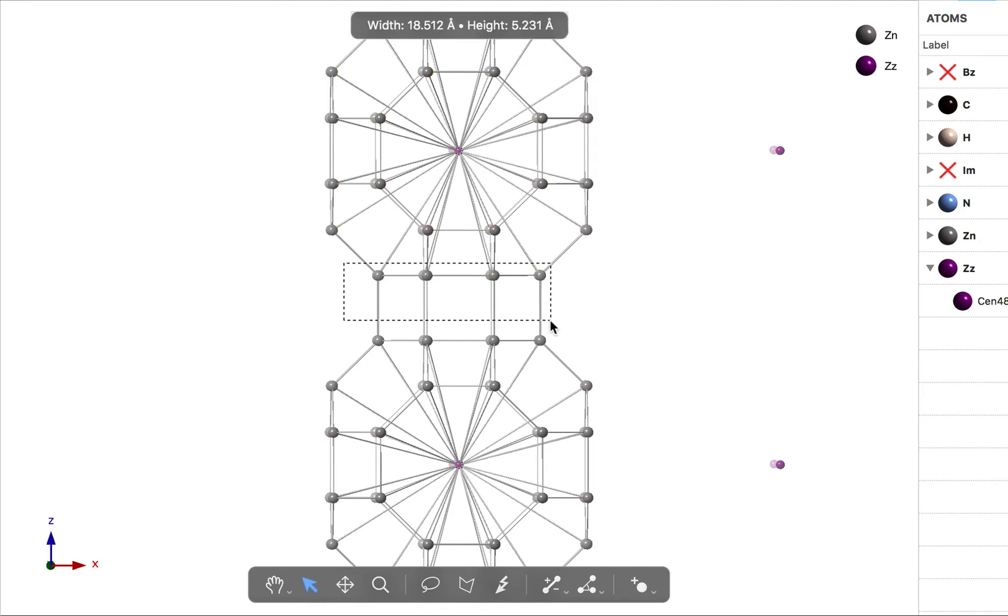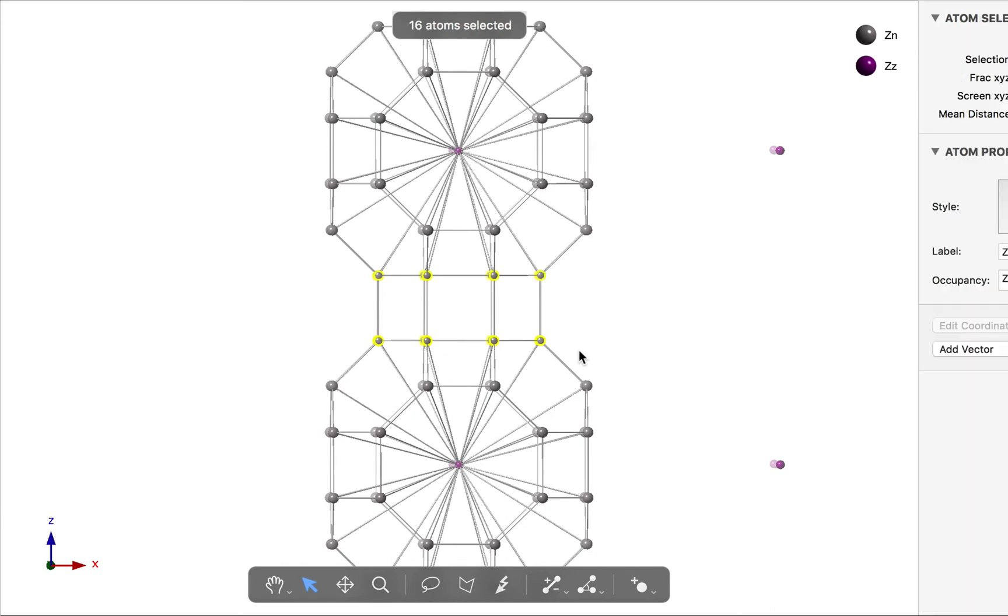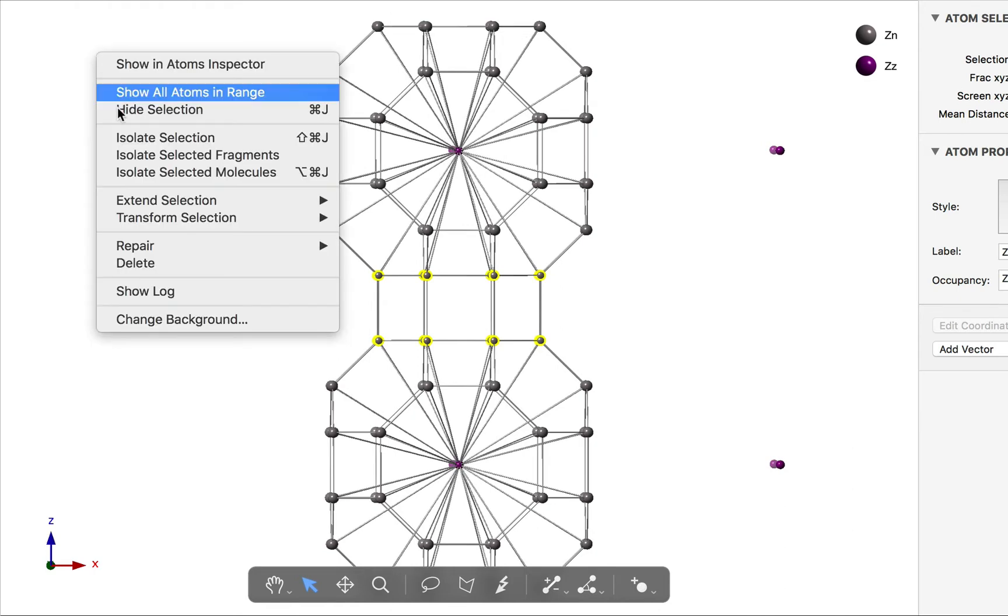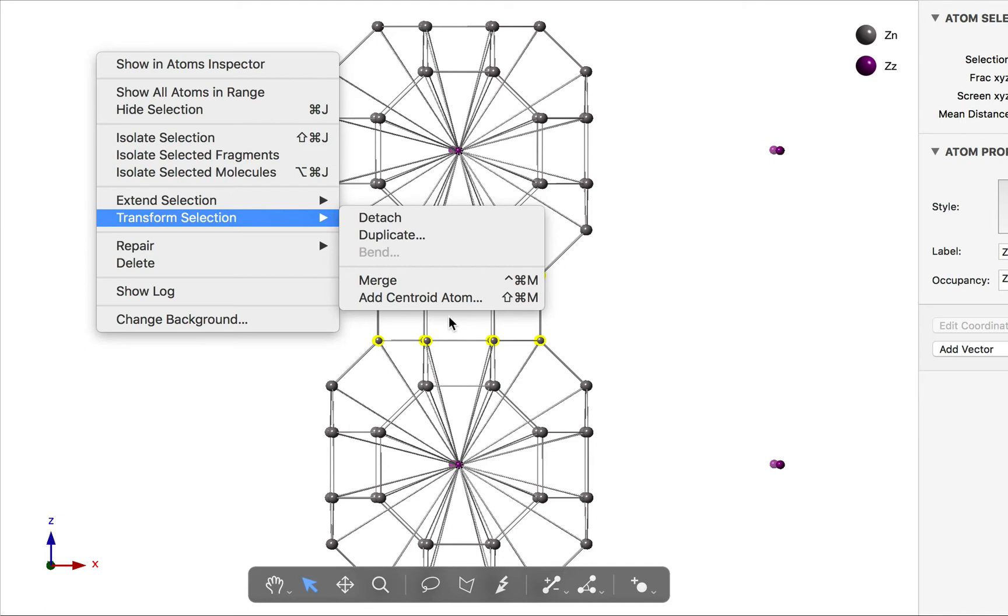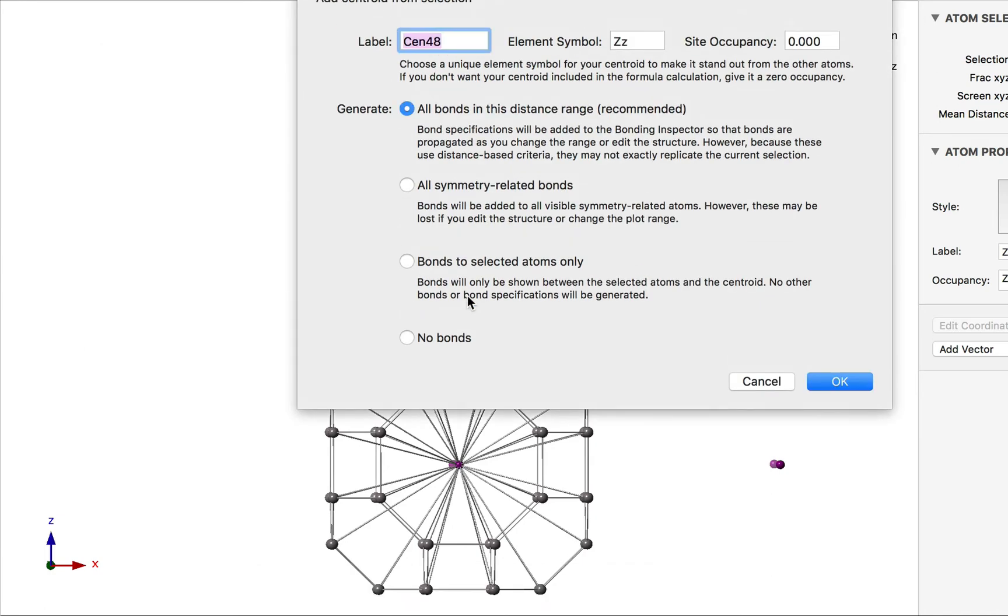Again, I'll use the arrow tool to draw a rectangle around that. We have 16 atoms selected. Let's insert a centroid atom. Same procedure as before. Right-click, Transform Selection, Add Centroid Atom.